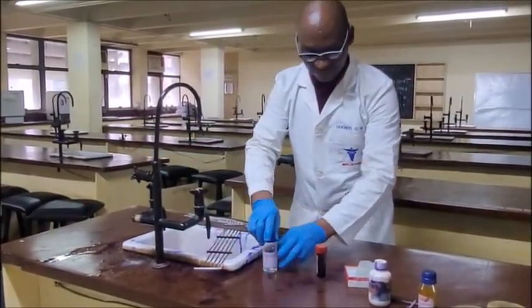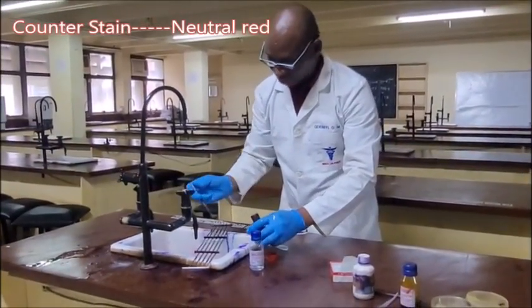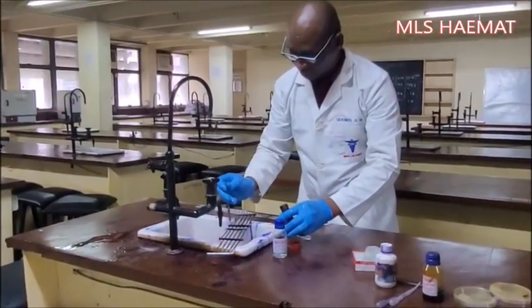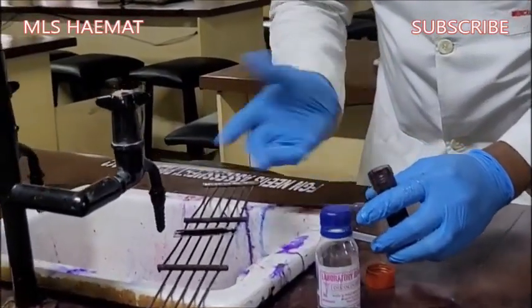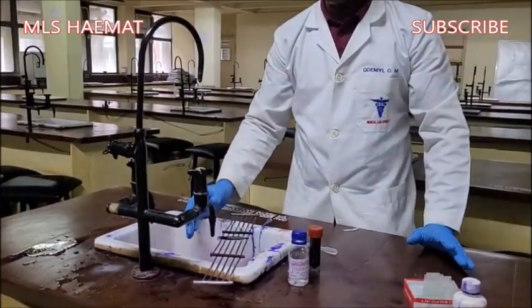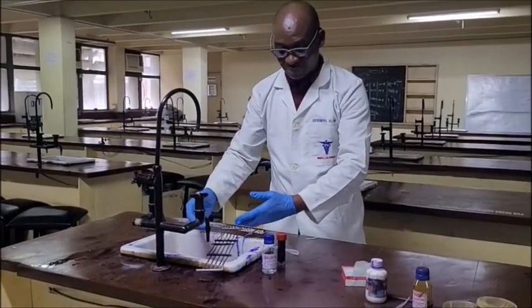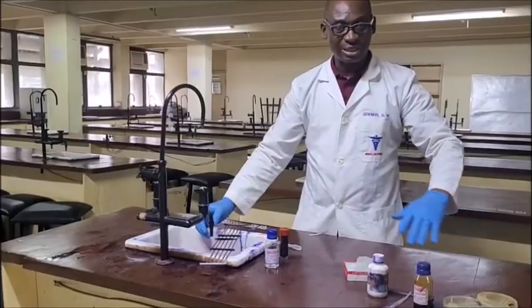The last stain is the counterstain, which is neutral red. Flood the whole circumference of the smear with neutral red and allow it to cover the entire smear area. Allow the counterstain to stay on the slide for about 1 to 2 minutes. At the end of the timing, flood the slide again under running tap water, then flood the back of the slide and allow it to stand on the slide rack to air dry completely.